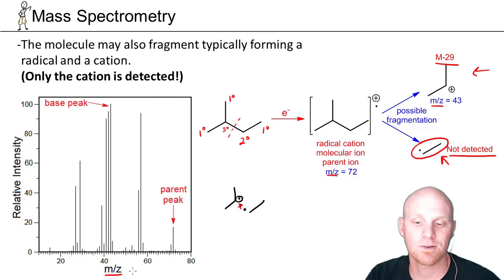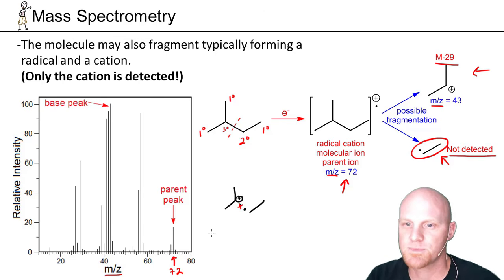The peaks we're going to look at are largely only going to have a +1 charge, so mass over +1 equates to mass. So keep in mind, we'll be treating this x-axis largely as mass, but you should know it formally as the mass to charge ratio. So if we look here, we found out that our molecular ion had an m over z of 72, and we can see that right here on our mass spectrum.